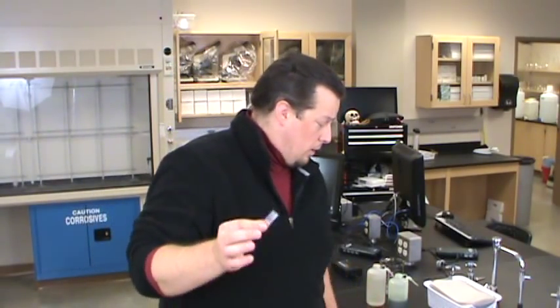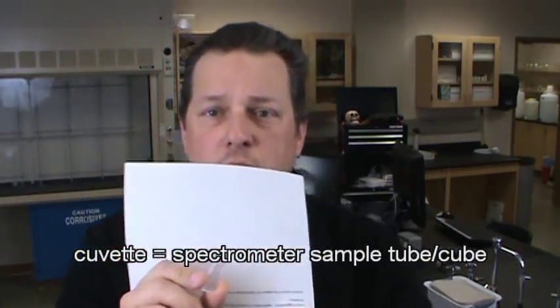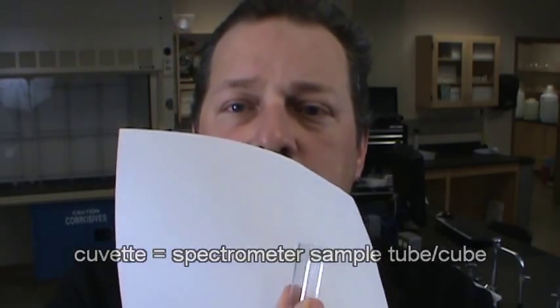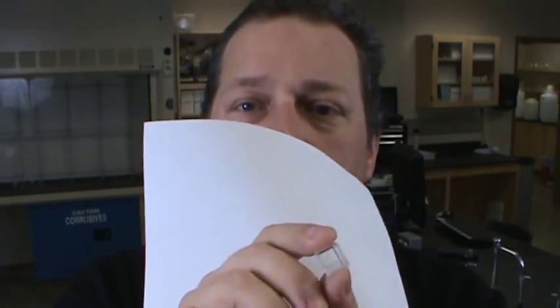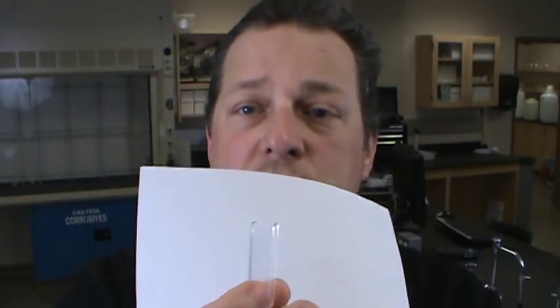Now for our samples and for our experiments, the path length is pretty well defined by what we put our solution in when we observe it. These spectrometers all use small 1 centimeter cuvettes. So the path length, let's see if that's easier to see against a white background. The path length in these cuvettes is determined by the size of the cuvette, and these are nominally 1 centimeter.